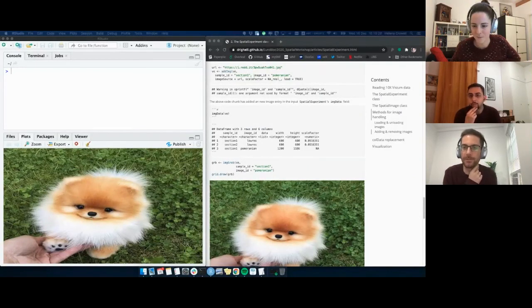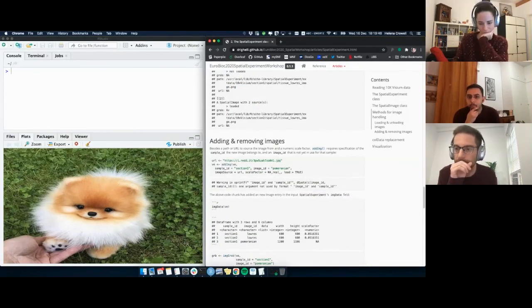They've either just released that or they're working on it, similar to CITE-seq, but on spatial, I guess. There were some comments from Mark about the layers being thick, in that each spot is multiple cells and the cells are multiple spots thick. Yeah, but probably we answered that.